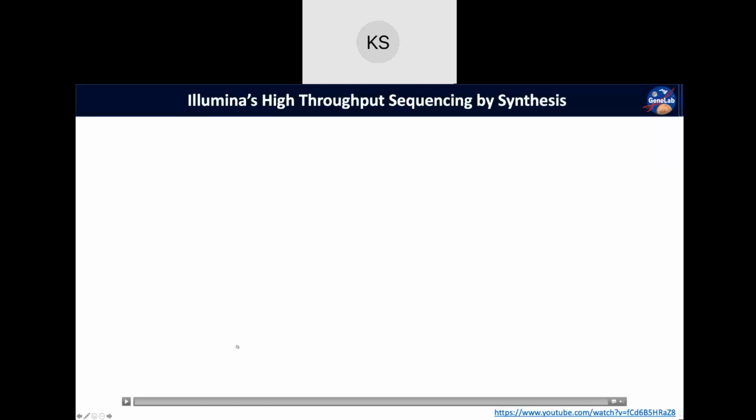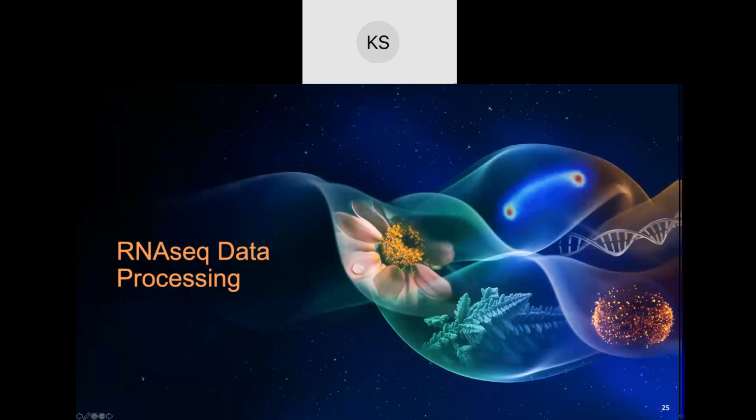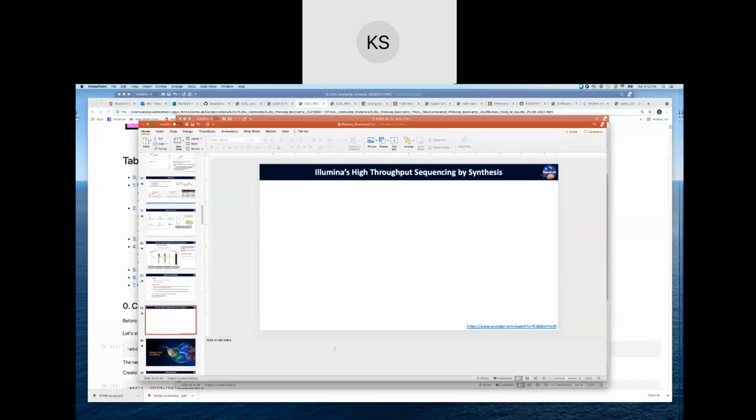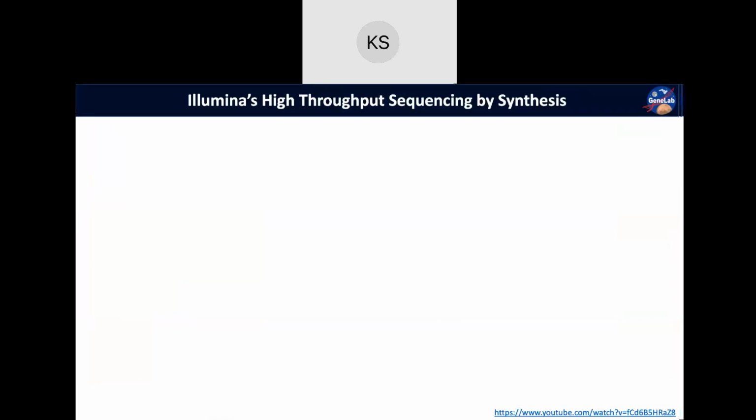Okay, so now you guys are going to watch one of my favorite Illumina videos, and I have the link here, and I'm actually going to post this link in the chat so you guys can watch this a million times. Maybe that's an exaggeration. I've seen this video over 20 times for sure. So I'll go ahead and play it now. It's about 5 minutes long, so not too bad. And it's going to go over the sequencing by synthesis that I just talked about.